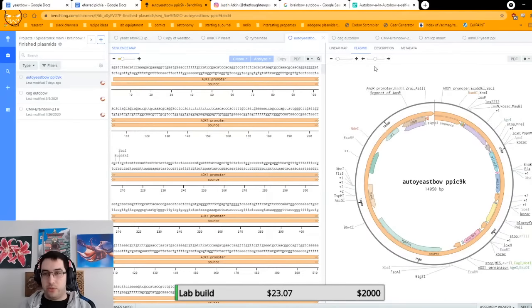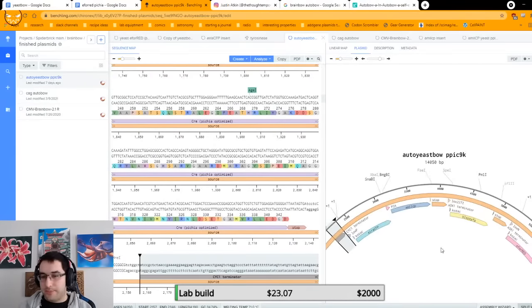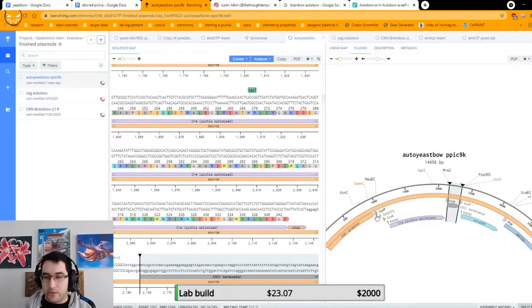So allow me to zoom in a little, shall we? Okay. So that's the terminator. Okay, so you see the loxP sites here: loxP, lox2272, and loxN. So these are the three different lox sites. Here's the Cre, and you'll see that it says yeast optimized.